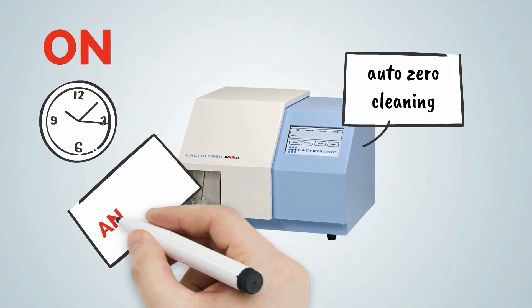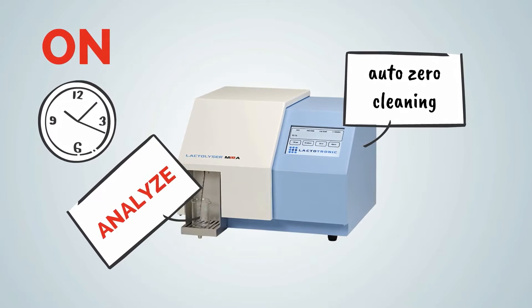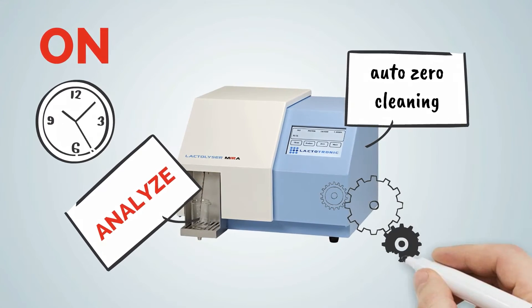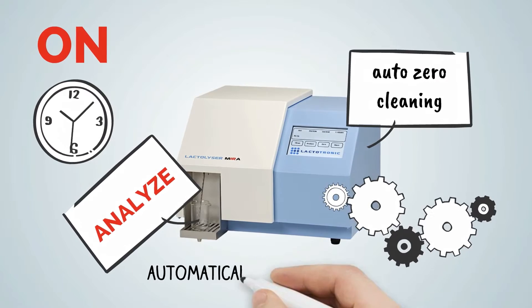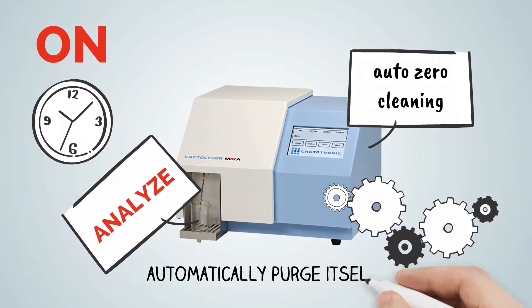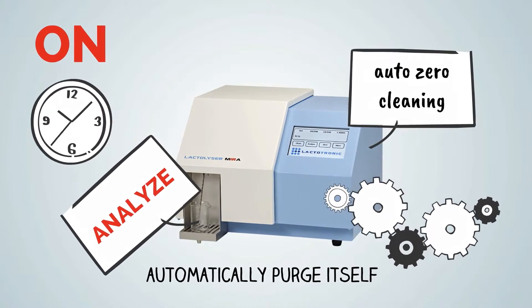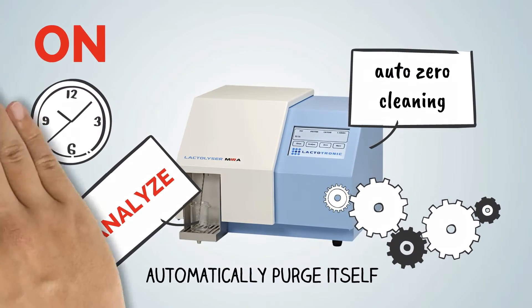Place your sample and select analyze. Once the analysis is complete, the instrument will automatically purge itself.